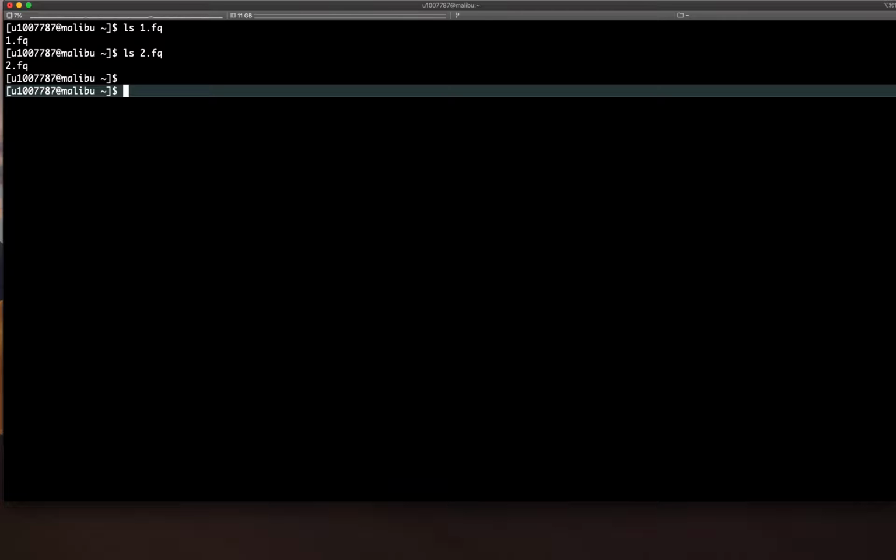So the standard for a paired end sequencing run, where we're sequencing the 5' end, both 5' ends from each molecule, we end up getting two FASTQ files, one for all the 5' ends and one for the other 5' ends for all those clusters on an Illumina run.